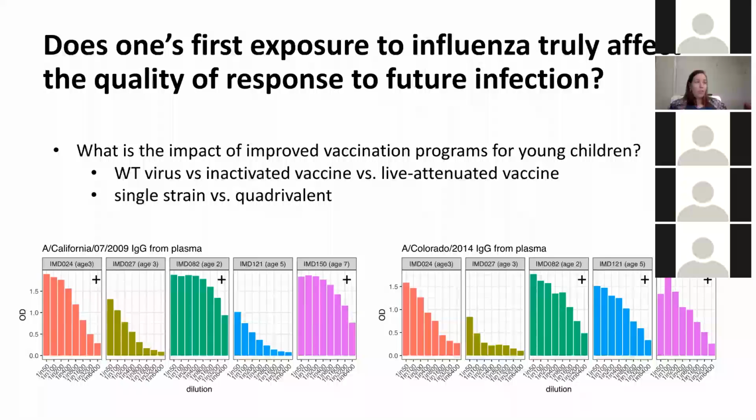So I've just started collecting some preliminary data on this by looking at plasma from the same children's cohort that I've been looking at with the tonsil organoids. So here we're looking at blood plasma, just to get an idea for whether children have an H1 response pre-existing in their blood, an H3 response, or both, suggesting potentially either infection or vaccination, at least to start.